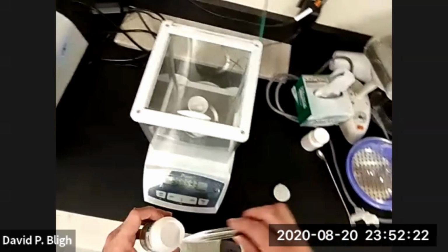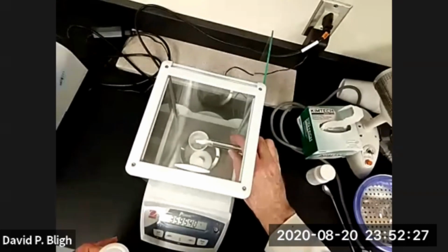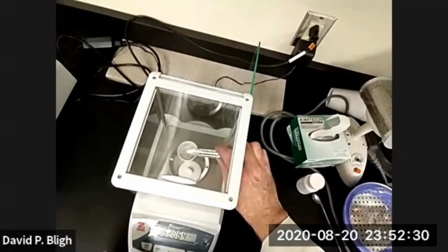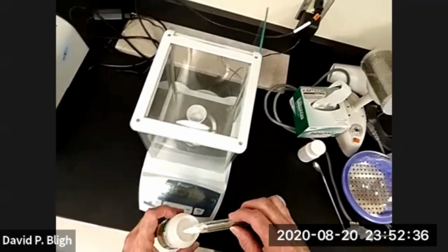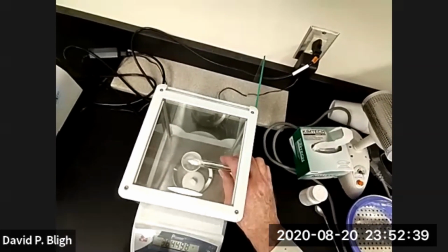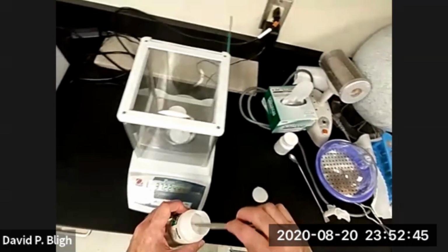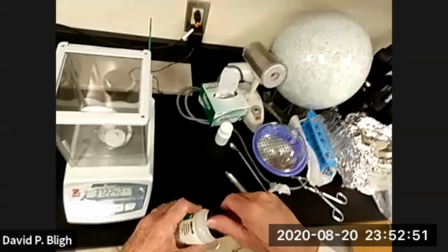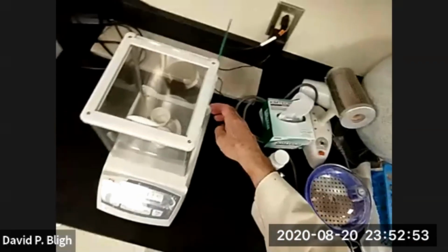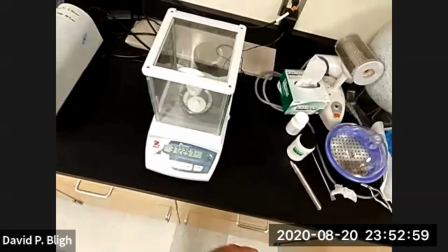Okay, I hope my head is positioned right so you can see what I'm doing. Otherwise, this whole video would be pointless. We're getting there. 36.45. Oops, I went over. That's okay. All we need is the accurate mass of the substance. 37.2256.